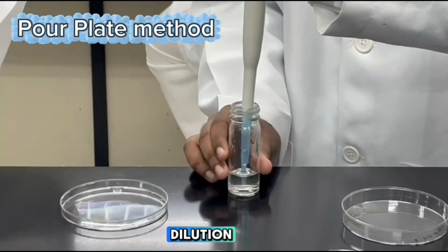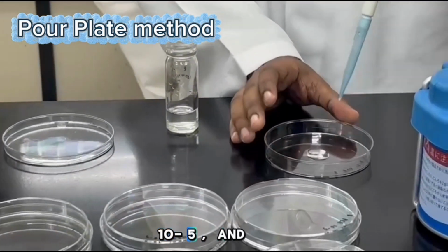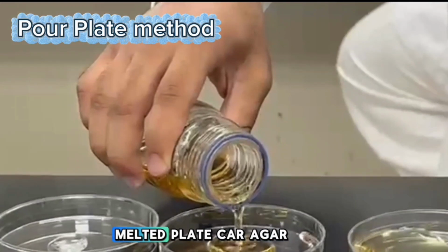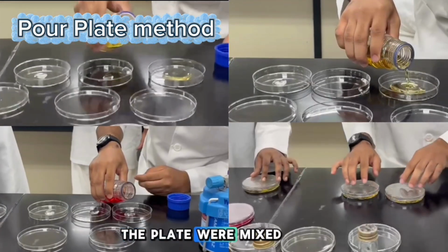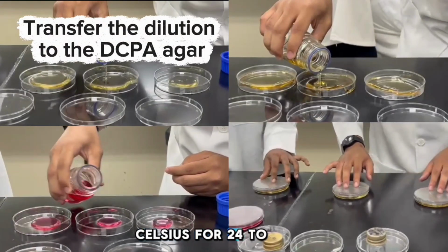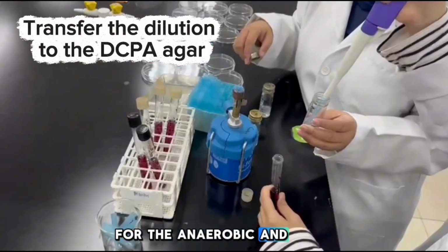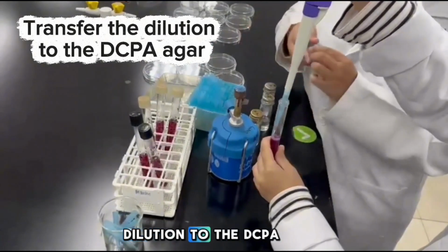From the selected dilutions, which were 10^-1, 10^-2, 10^-3, 10^-4, 10^-5, and 10^-6, 1 ml was transferred into sterile petri dishes in duplicate. Melted plate count agar, PCA, was poured into the plates using the pour plate method. The plates were mixed gently and allowed to solidify. Then the plates were incubated at 37 Celsius for 24 to 48 hours. For the anaerobic and aerobic, using DCPA agar, transfer 1 ml of dilution to the DCPA.